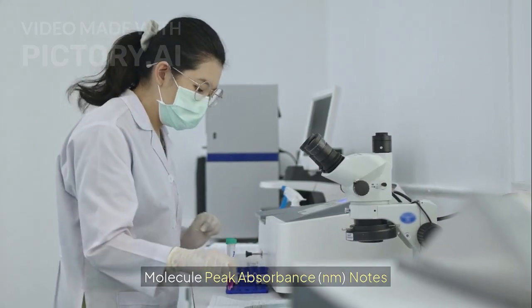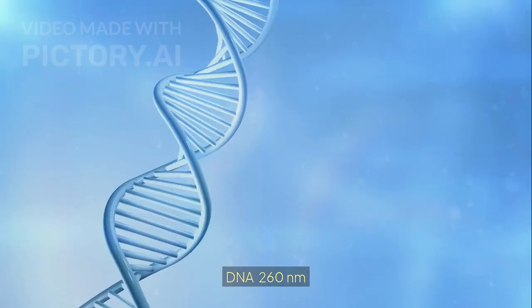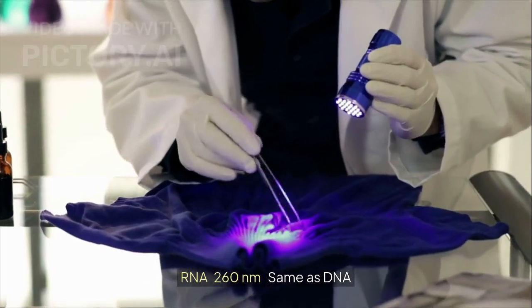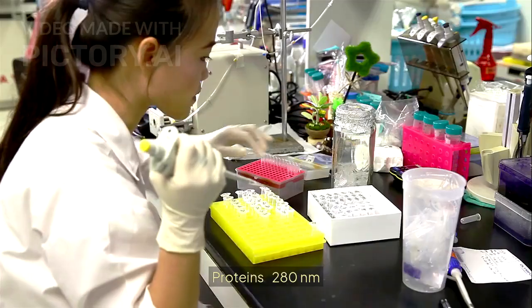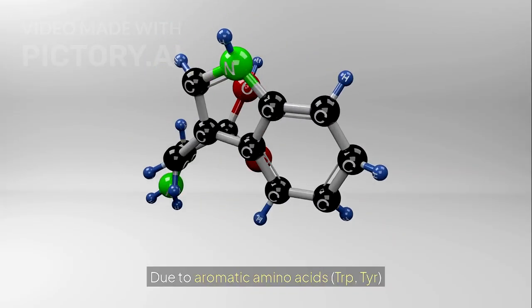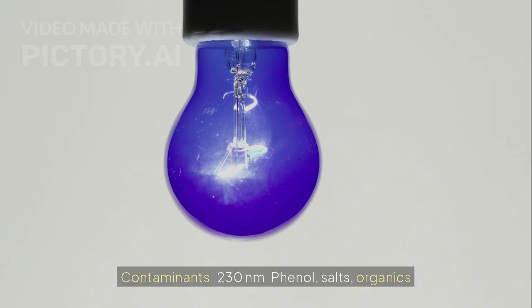Wavelengths for nucleic acids and proteins. Molecule, peak absorbance in nm. Notes: DNA, 260 nanometers, indicates nucleic acid content. RNA, 260 nanometers, same as DNA. Proteins, 280 nanometers, due to aromatic amino acids, Trp, Tyr. Contaminants, 230 nanometers: phenol, salts, organics.